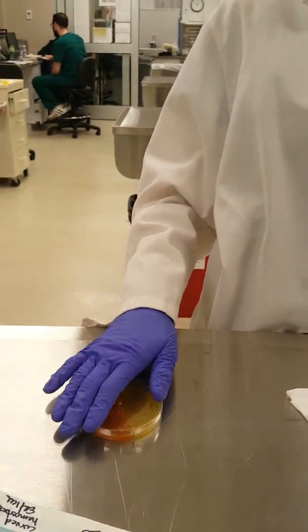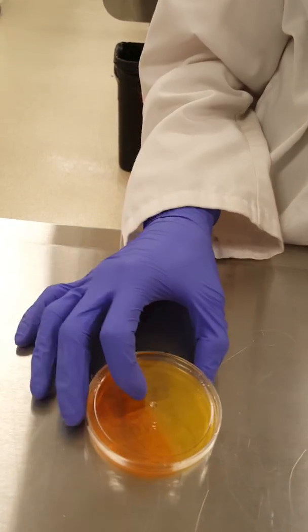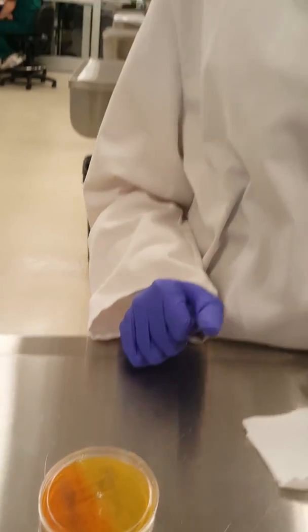And then we will go ahead and put our lid back on, and then we're going to set this in a dark cabinet for 24 to 72 hours. We'll check it daily to see if there's any growth or to see if it has changed colors. So if it is positive, it's going to turn red according to the manufacturer. So we will come back and check that later. Thank you.